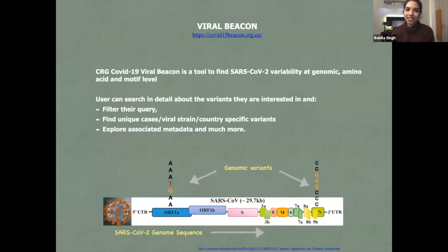What I'm going to present here is what we developed as a user interface to see all of this data, especially this raw data coming from the Illumina platform, because at the time there were consensus data available, and for epidemiological studies, it's good. But we were wondering if it might be useful to see directly into the raw data.